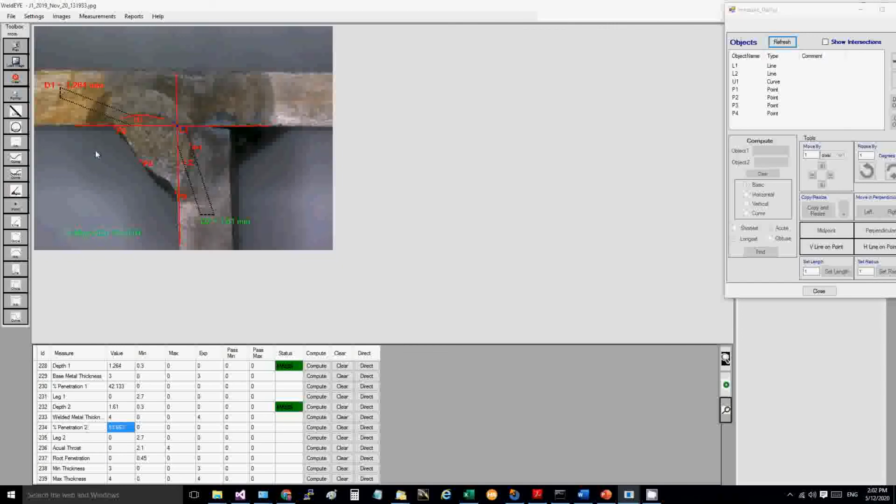There are also additional features: if you want a comment, you can right click and add text. You can also specify arrows. These features are available both in the basic mode as well as the advanced mode. You can add any number of comments in the image. You can change the color and font of the boundaries you define.